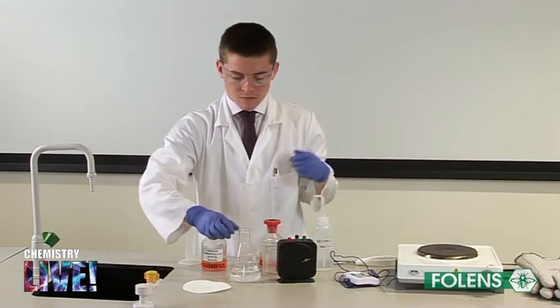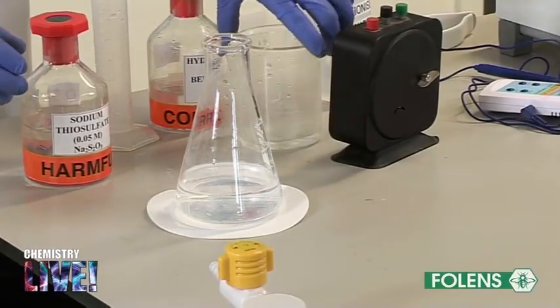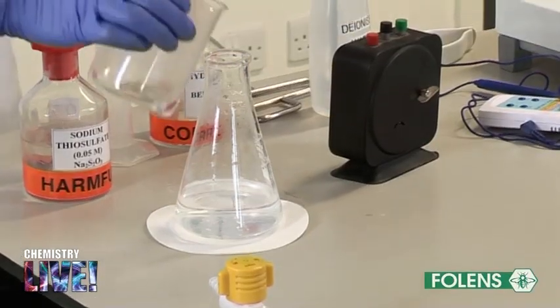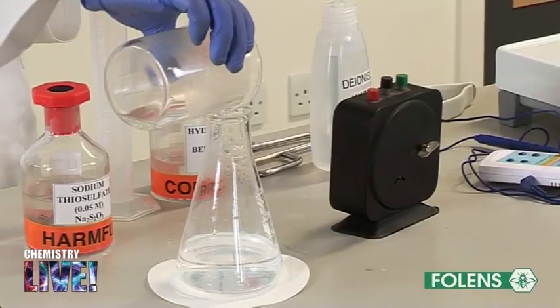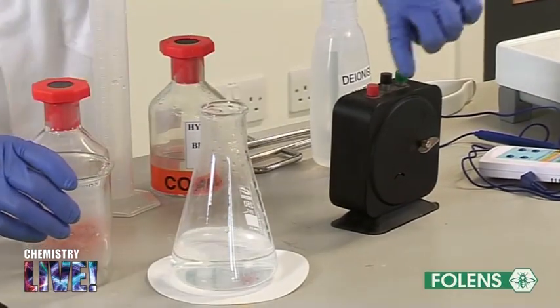Place the conical flask on top of the cross. Add in the 10 centimeters cubed of dilute hydrochloric acid to the conical flask and measure the time it takes to obscure the cross.